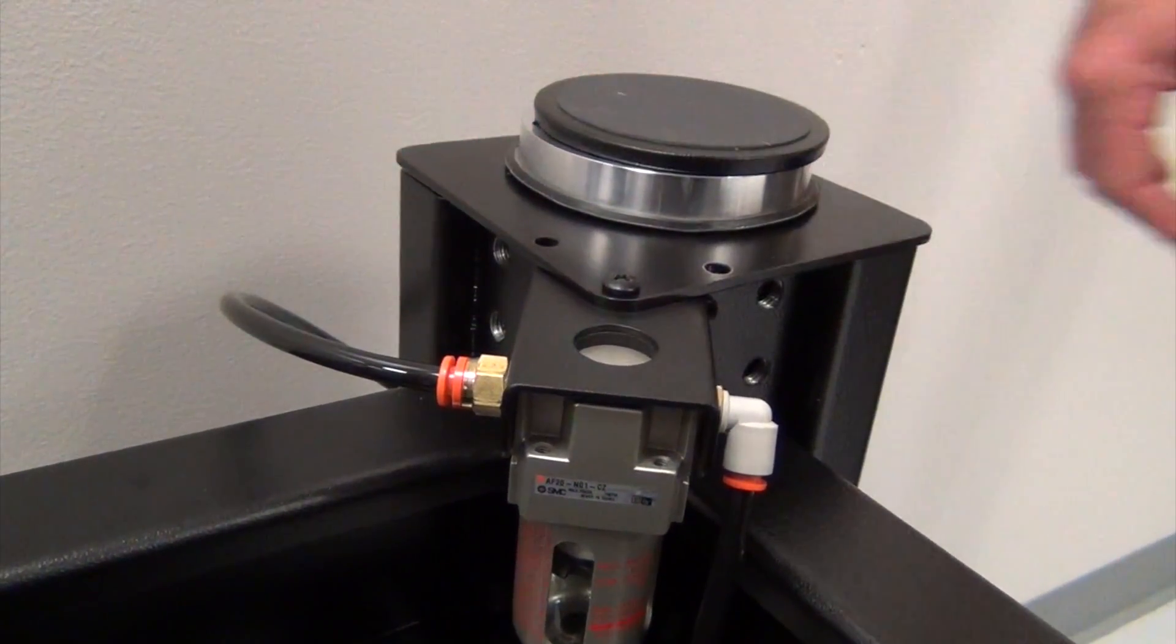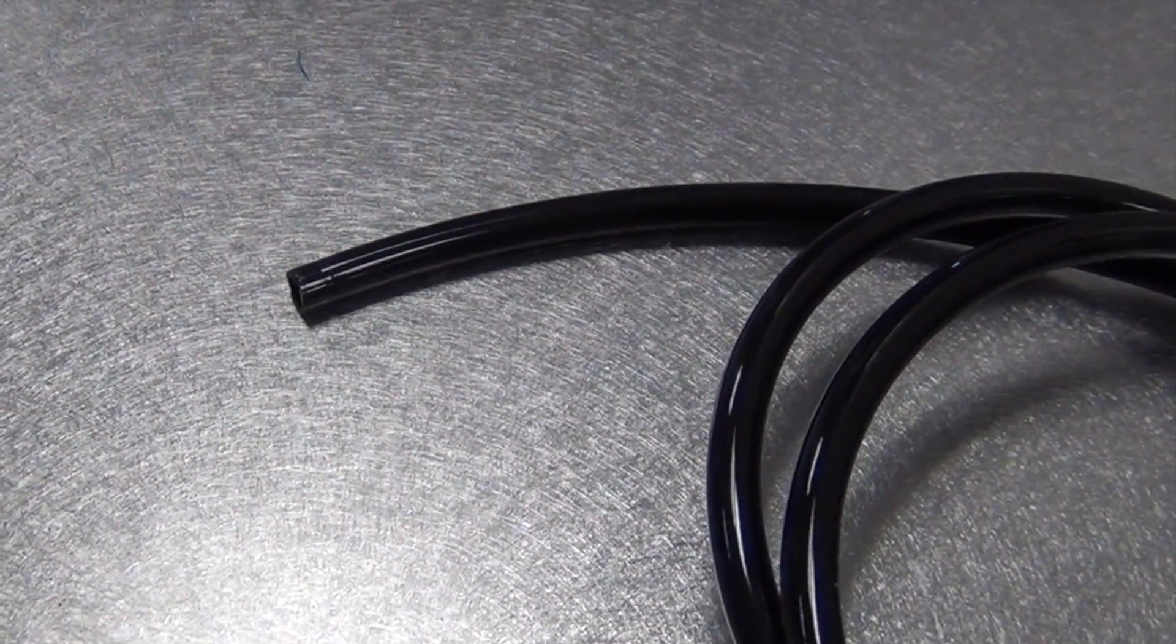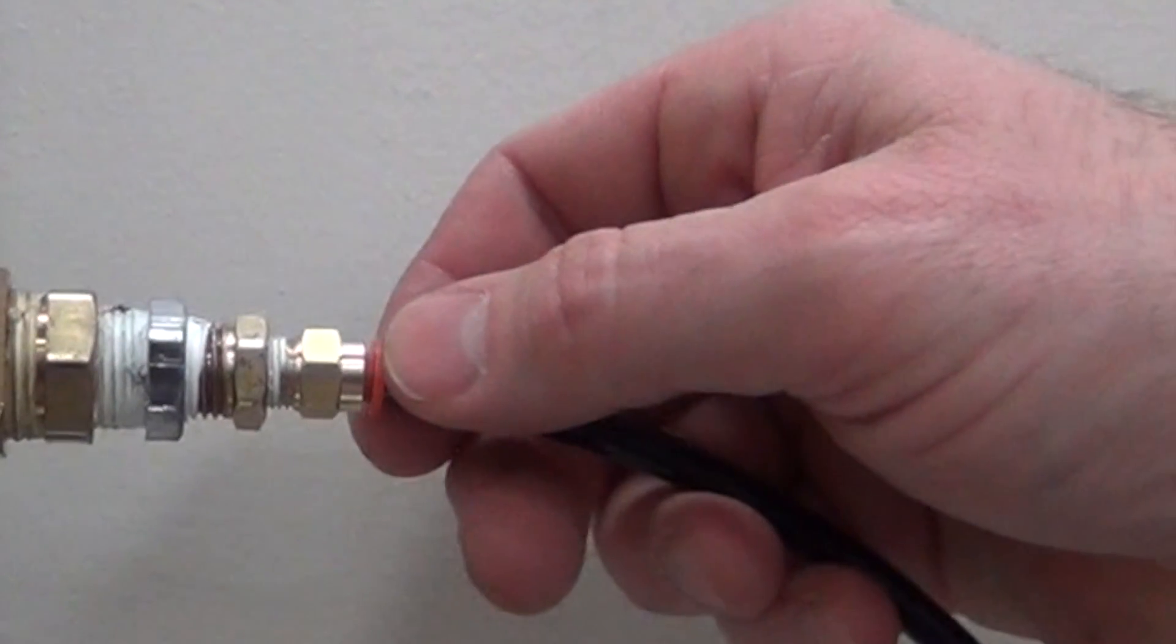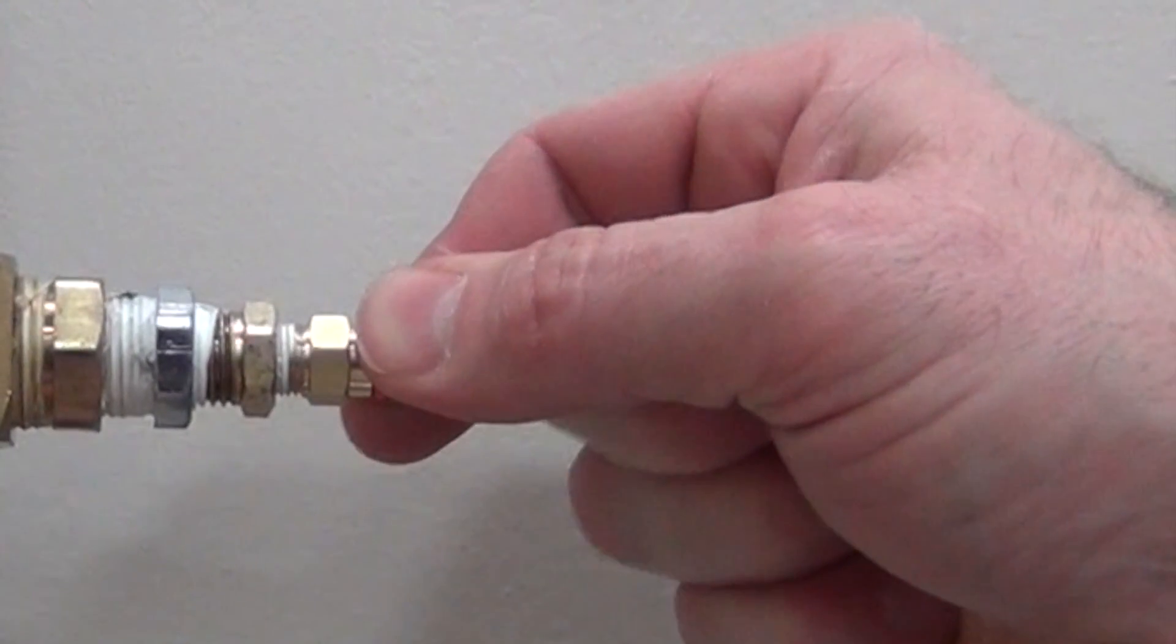If the tubing needs to be cut, it must be clean and square to the ends, not at an angle. To remove the tubing, press the lock connector, push the orange ring in towards the fitting, and pull the tubing out.